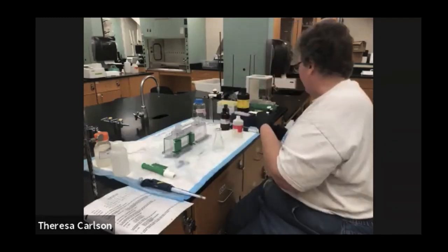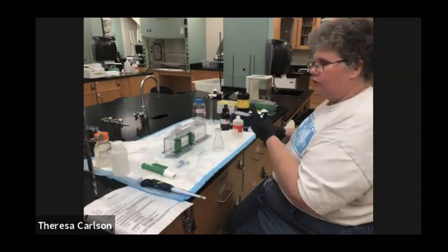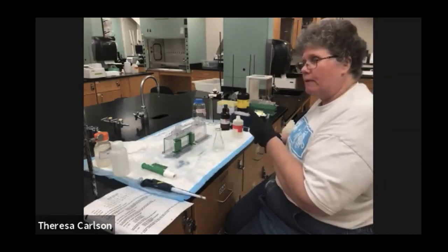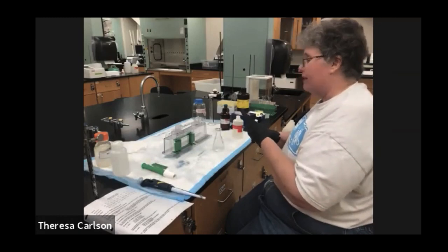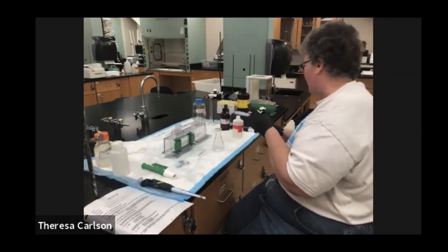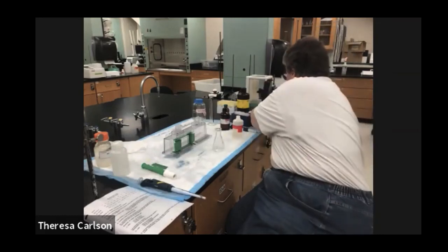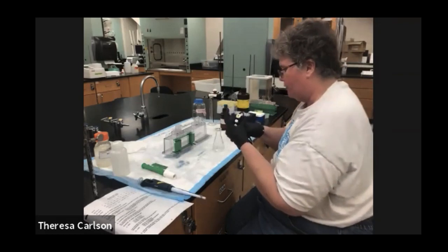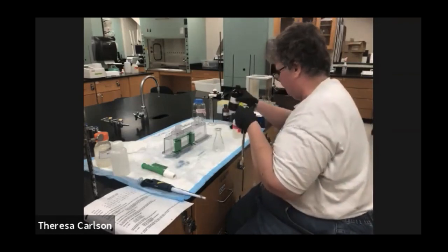Now remember last time I said that you needed to only add 20 microliters of TEMED instead of 10. But that's because we had a larger volume last time. So this time you do actually want to add 10 microliters of TEMED. If you do 20 this time, it will polymerize too fast before you get a chance to do anything with it.